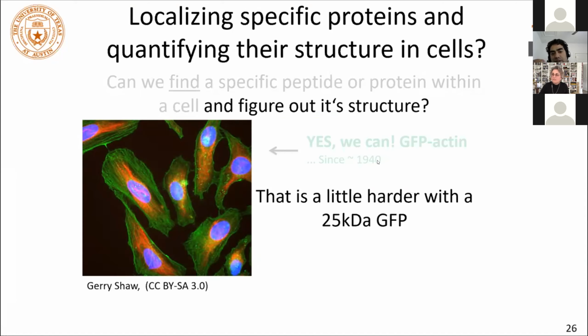I've seen parts of those proteins that scaffold onto those in focal adhesions that have been labeled, but not those proteins themselves, because I think it's kind of challenging to get those proteins labeled with fluorescent proteins that are 15 kD or 25 kD on either side and really not disrupt their function. I think that's difficult to do. And so that's a challenge that's been out there for a while.